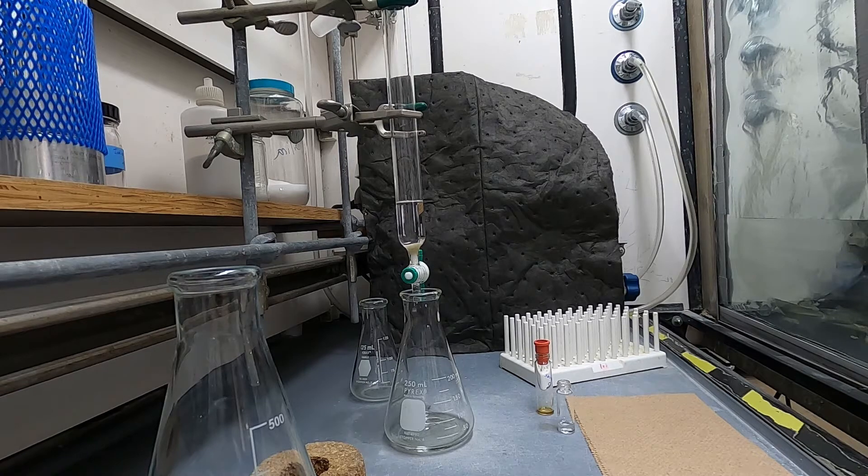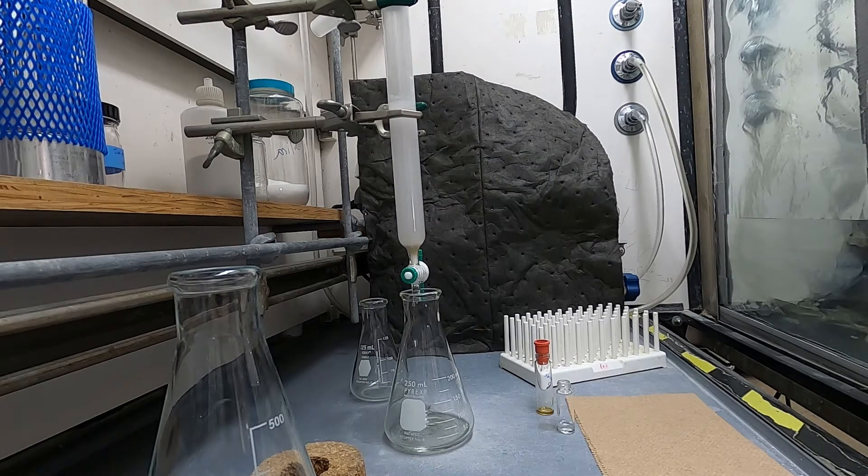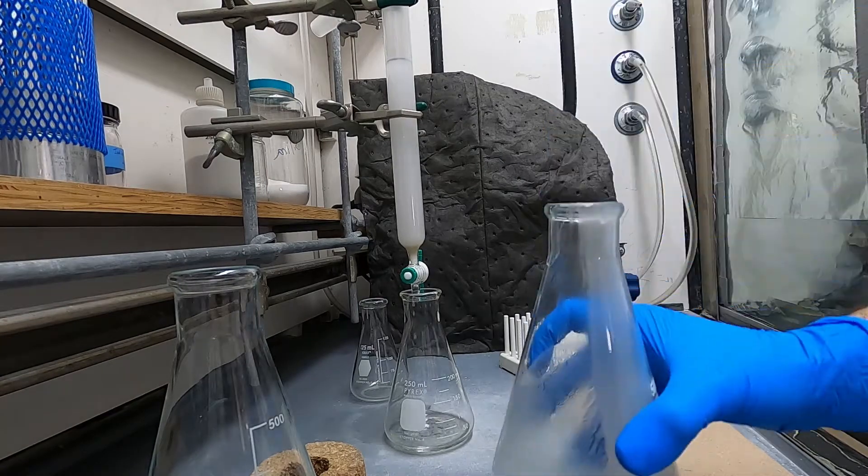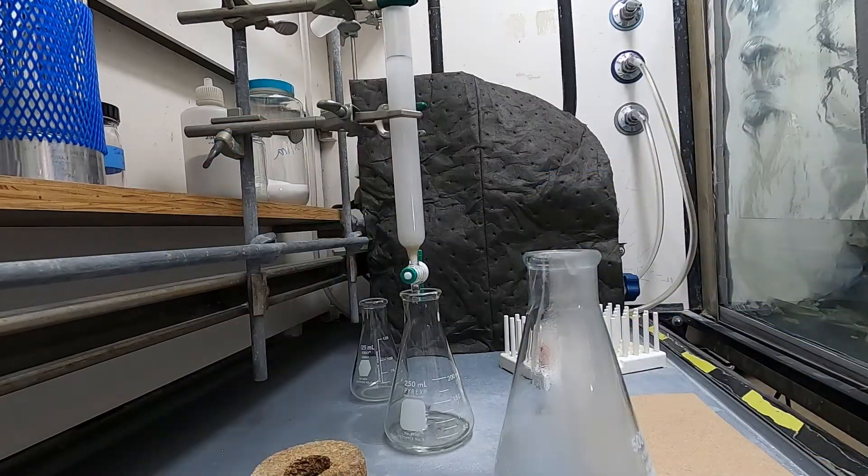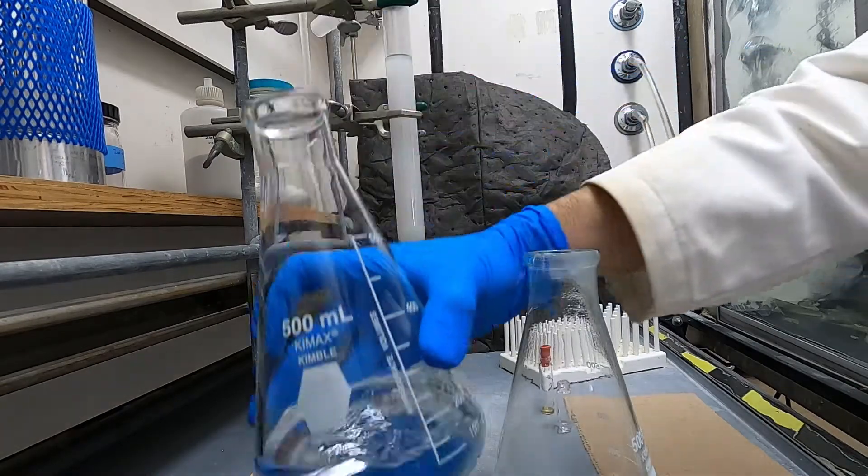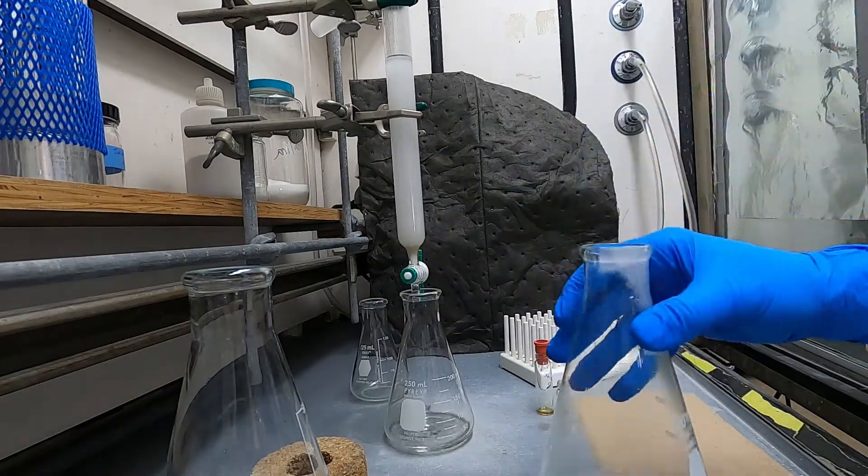I added it a little bit quickly here but you can see that it didn't really disturb the sand layer because we had so much solvent above that so overall that's pretty good. And then I'll just do a couple more rinses to transfer all of the silica to the top of the column.